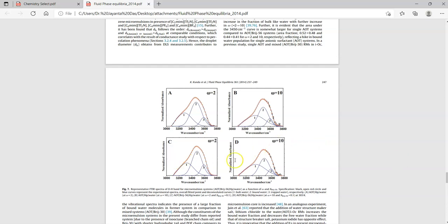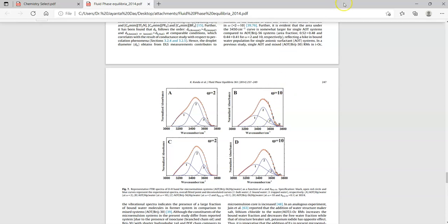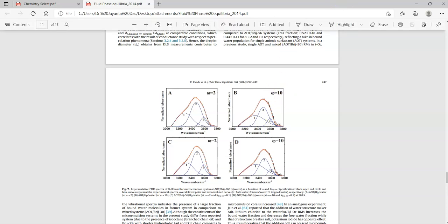This is the water spectra from FTIR. This is a broad view. The matter is how can you do this in your own arena. Like if you have different peaks which are assembled, how could you deconvolute or identify the specific peak. For that we will utilize the Origin software.